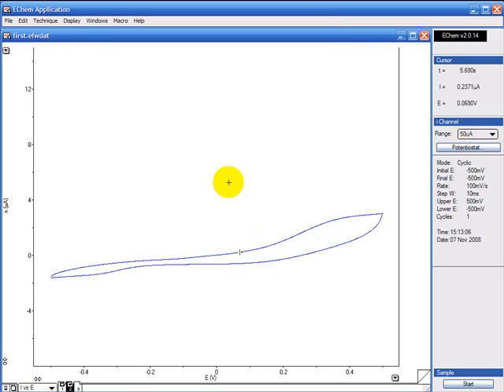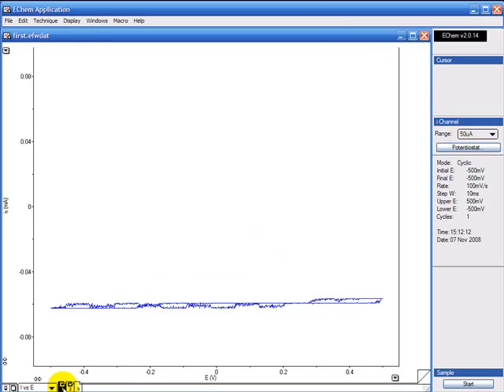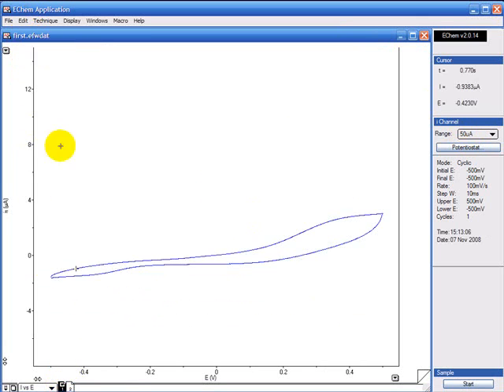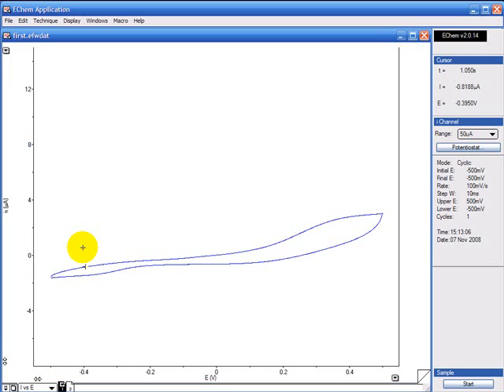Now that that run is finished, we have our first run here which I'm going to delete. To do that you select it, go to edit and cut and that's cut that run from our file.